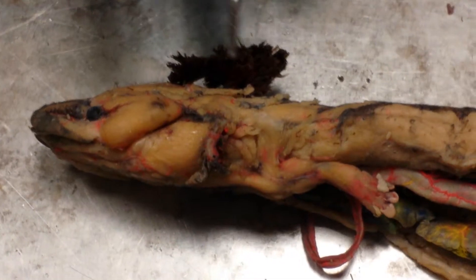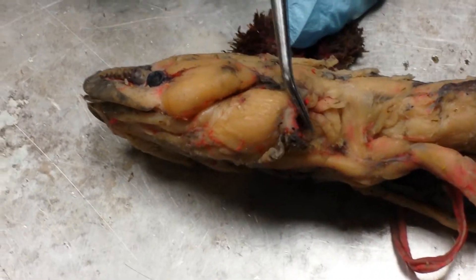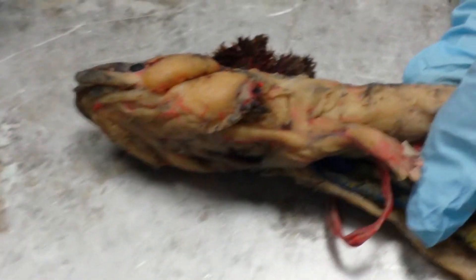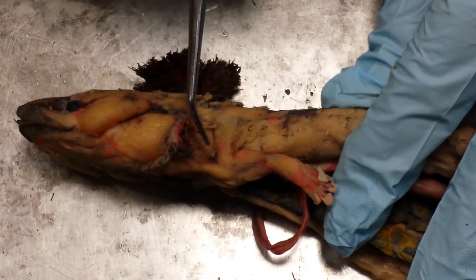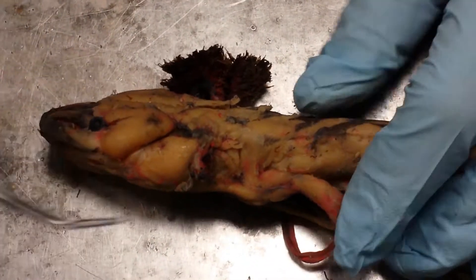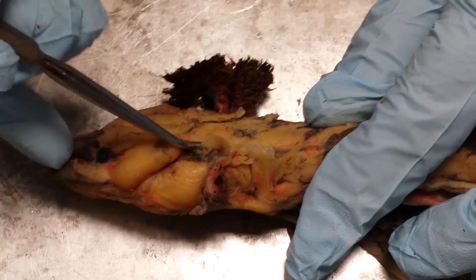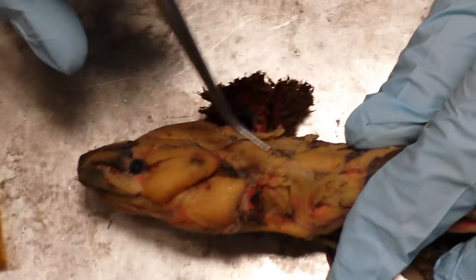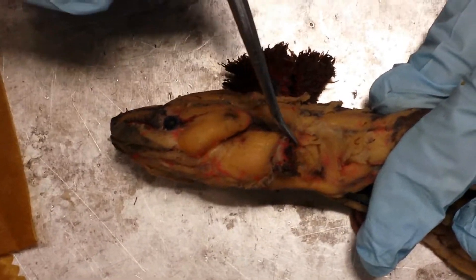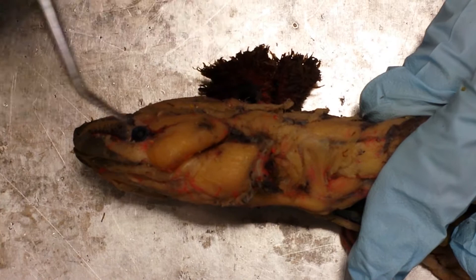On the side of the salamander by the gill, there's a set of dorsal muscles that run just dorsal to where the gills were — they run in a fan shape. Those are the levators arcuum. At the end there's a bigger singular muscle right here, and that's called the dilator laryngus.